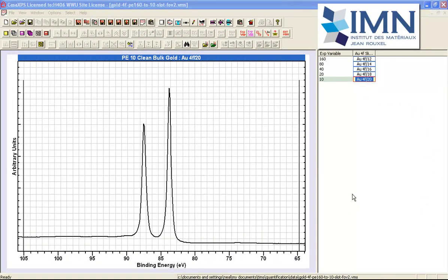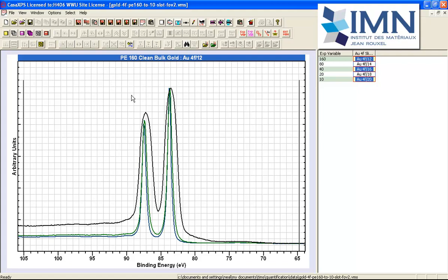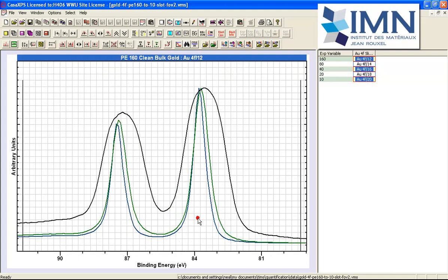The question is why does pass energy make a difference to the shape of these peaks? If we look at three different pass energies—160, 40, and 10—we end up with quite a substantial difference in the shapes of these peaks. The energy resolution changes and the intensity changes.